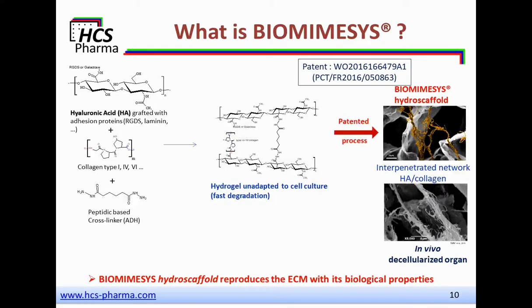And we see in the picture the same composition in comparison with an in vivo system, a decellularized organ.